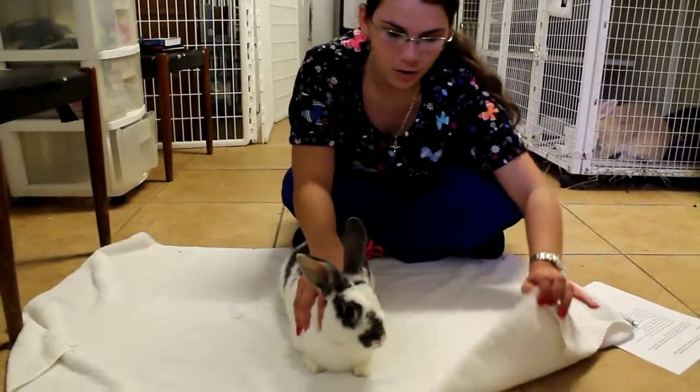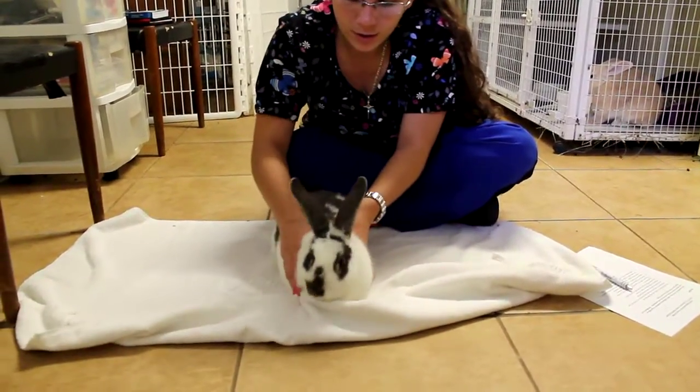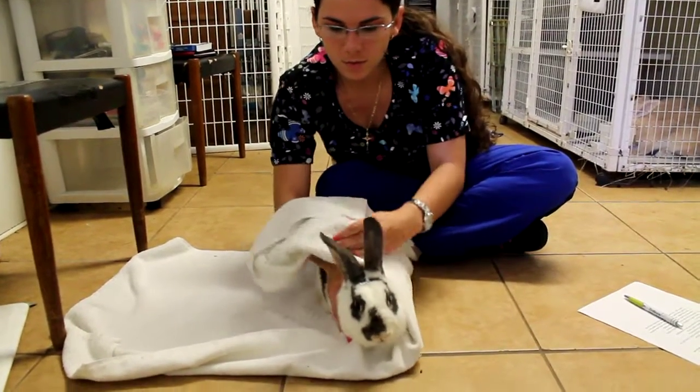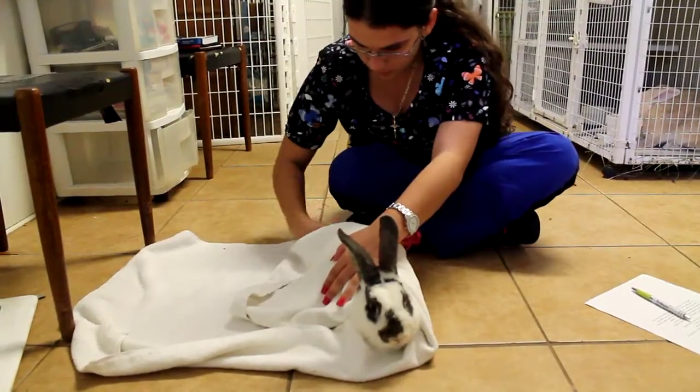We're going to restrain this rabbit with a towel. I'm going to fold the towel up over his front limbs and wrap this around tightly, securing his body and his rear legs.